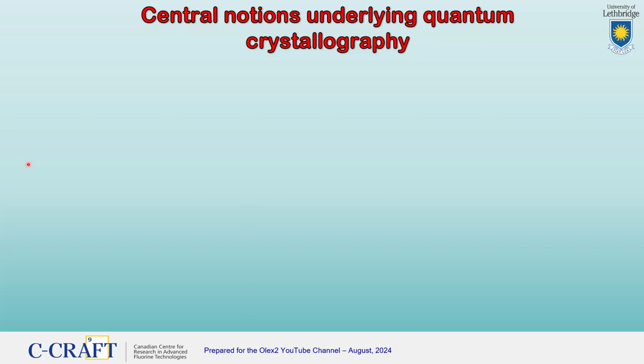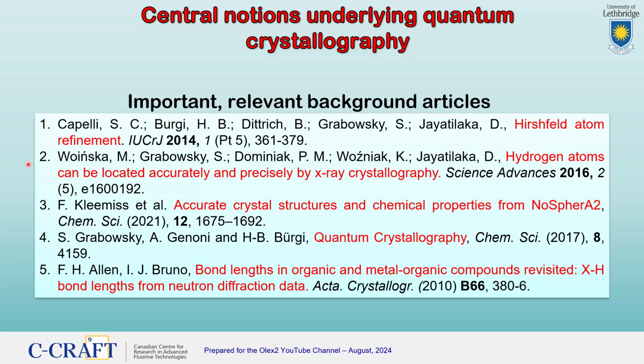Now, there are some central notions underlying quantum crystallography that we need to be aware of. I'm not going to go into great detail of the theory, just enough to set the context for what I'm talking about, and you'll have to read further. I would suggest you start with these five titles.